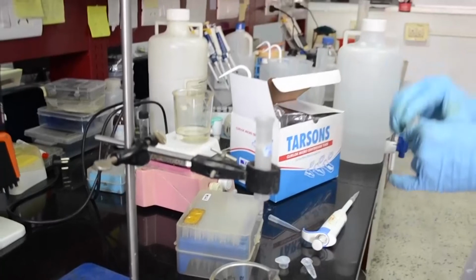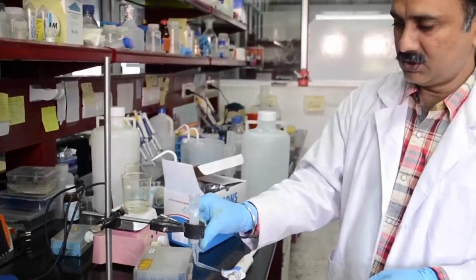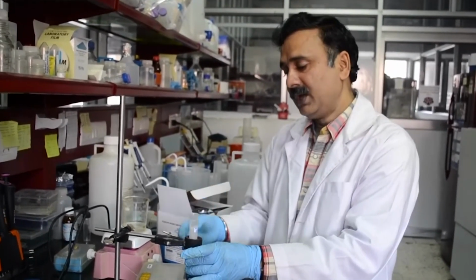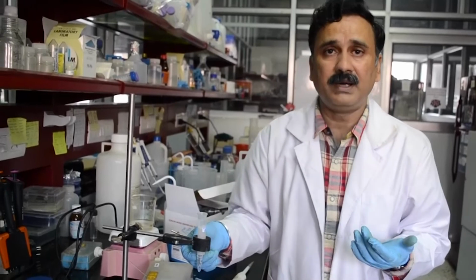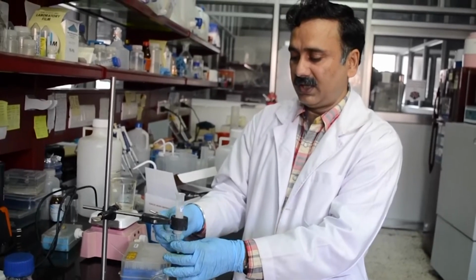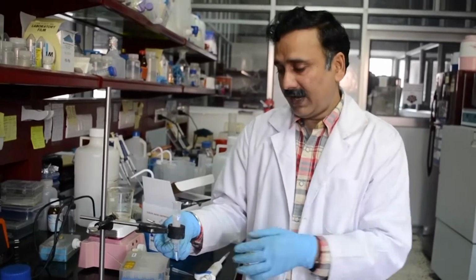Because the protein you are adding is very big compared to the salt present in this particular protein sample, the protein is going to be in the exclusion limit of the column, so the protein will come out first.